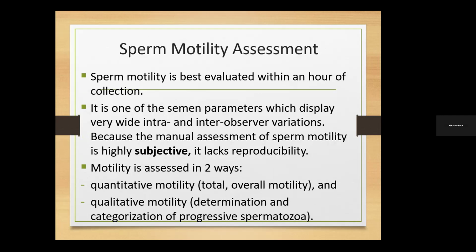And if you find yourself somewhere, somebody talking about sperm wave motion test, and you have done semen analysis or seminology with me, and somebody mentions this and you have no idea, I think that would be an indictment on me, and so that's how come we introduce it. Not that it's part of traditional semen analysis.